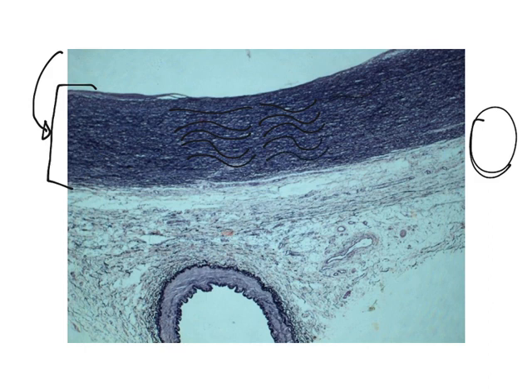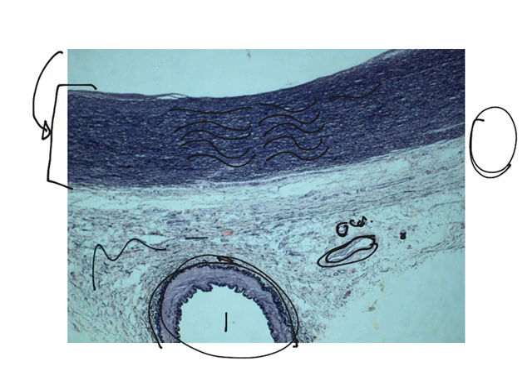It's also a fairly large vessel, and large vessels have what we call vessels of vessels or vasa vasorum. And so you see all these other vessels. So here and here, this is actually an artery. This right here, there's a vein, and these are capillaries. And this is just connective tissue there. So this is the aorta.